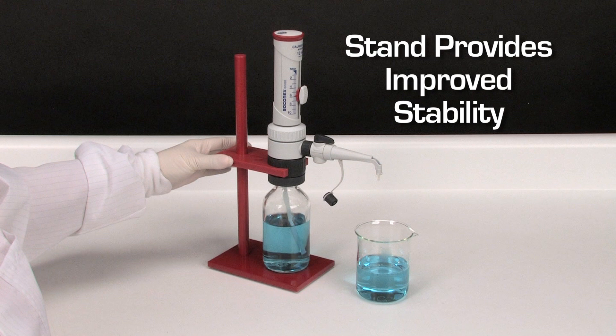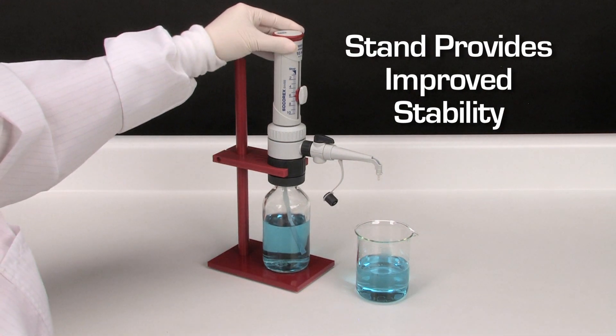The specially designed stand holds the dispenser when attached to a small bottle.